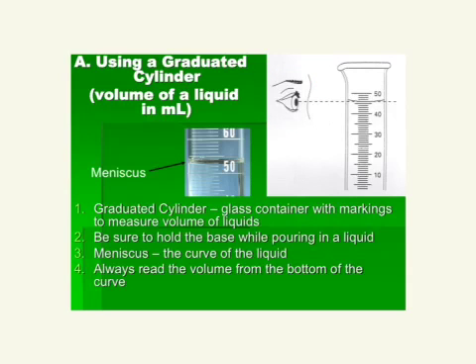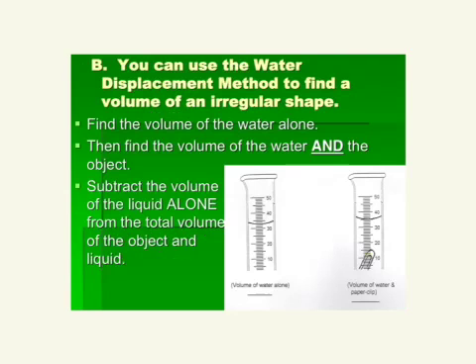Also, always read from the bottom of the curve. Yep, there you go. All right. You can use the water displacement method. So water displacement method to find the volume of an irregular shape.